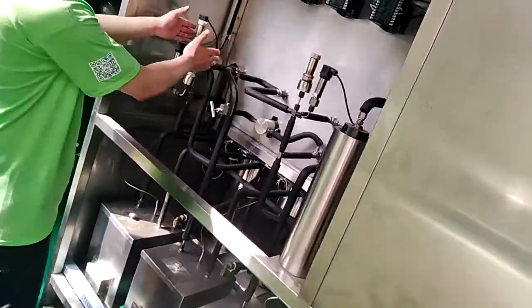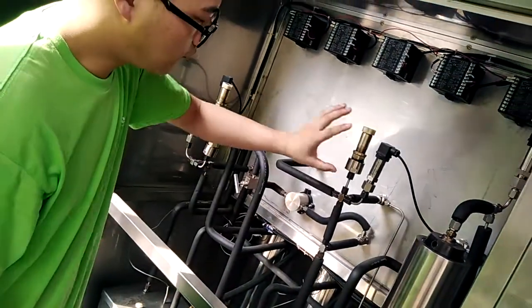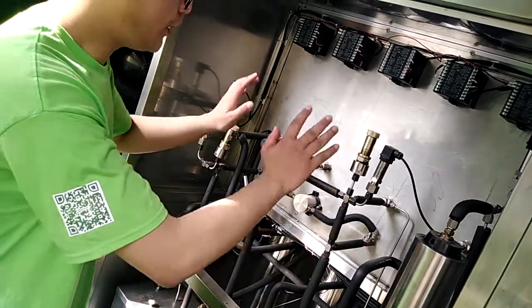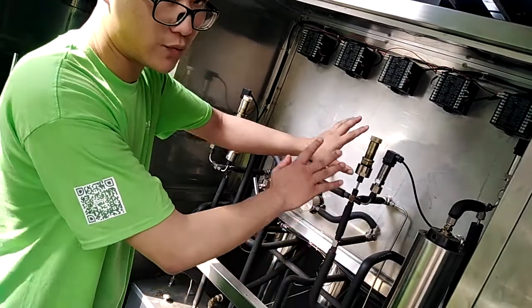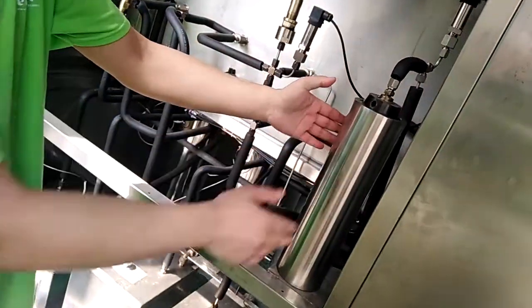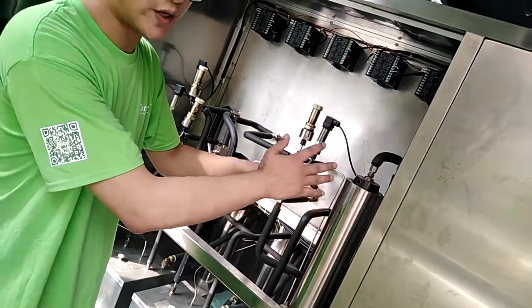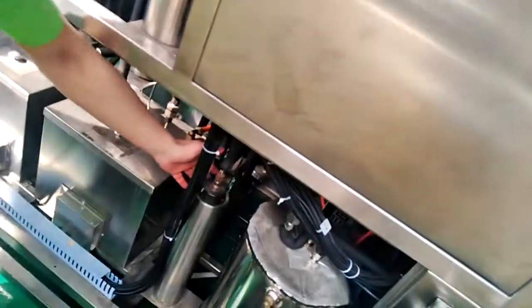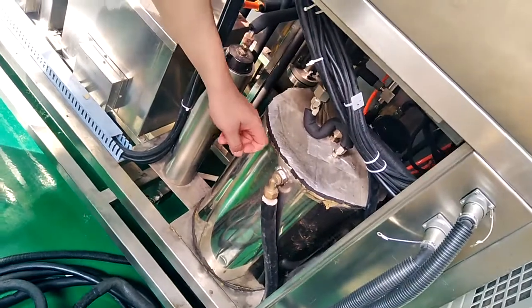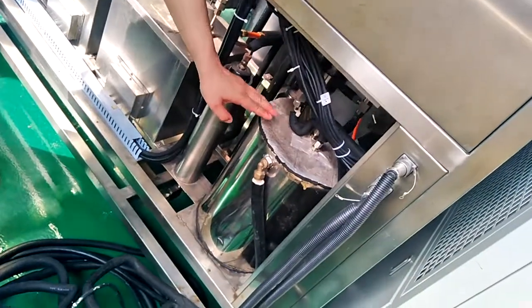So the vessels will be kept at a warm temperature. These are safety valves for each vessel. This also keeps the system safe — if the pressure is over its upper limit, it will work to relieve the pressure itself. And here is a mixer where CO2 and the co-solvent will mix inside. This is a filter, and this is a CO2 storage tank — in the US and France they likely call it an accumulator.